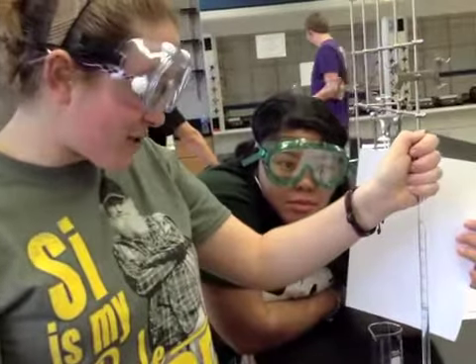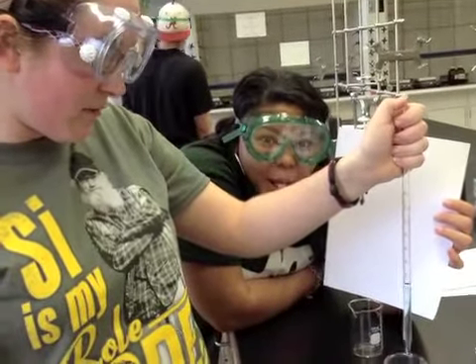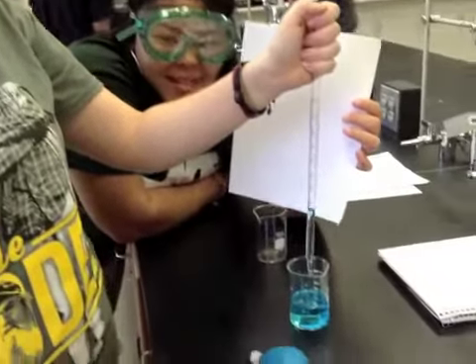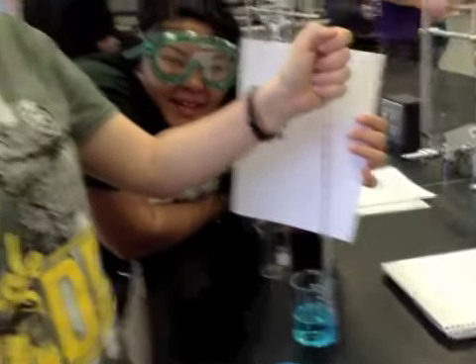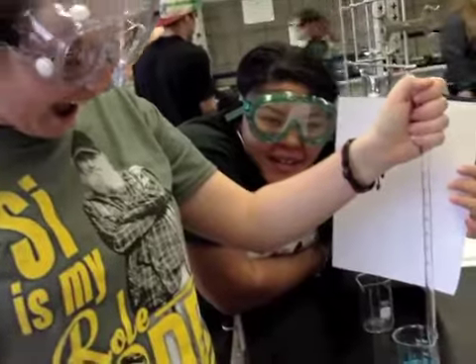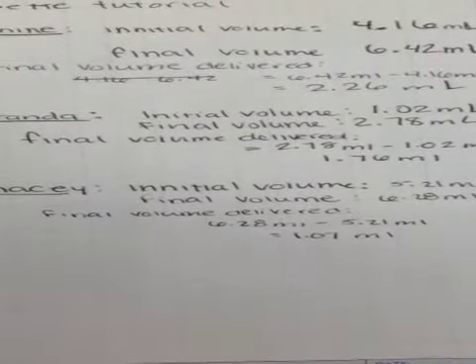Now that both the initial and the final volumes have been taken, release the liquid back into the container. The final volume delivered for Casey's pipette was 1.07 milliliters.